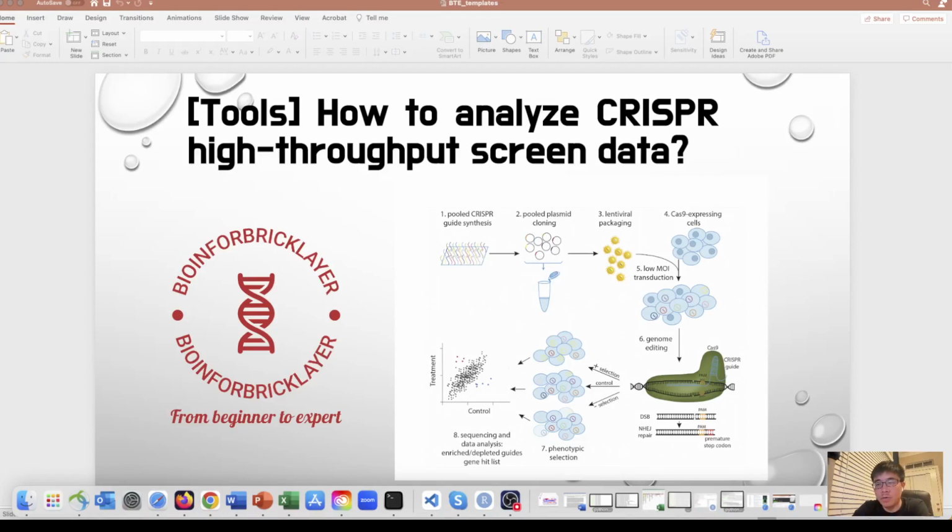Today we're going to continue talking about how to analyze CRISPR high-throughput screen data. In my last video, I introduced the experimental approach of normal CRISPR high-throughput screens and how we can use a tool called MAGeCK to map the reads to our sgRNA library, count each sgRNA, and get a preliminary result of the hits. We will continue to validate.